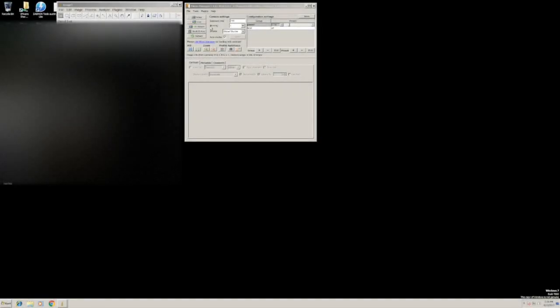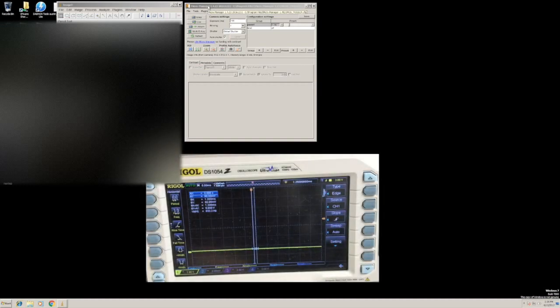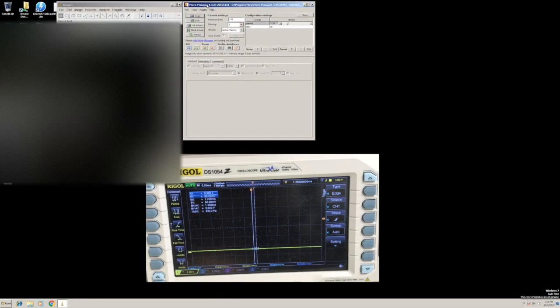So I saw a bunch of people on the Micromanager listserv asking about pulse width modulation control over an LED. I figured I'd make a little video showing a modification for the Triggerscope for this. This modification will work with the Triggerscope 2 or the Triggerscope 16, but when used with the 16 during the mod, you won't be able to use the DAC output lines that you select for TTL control.